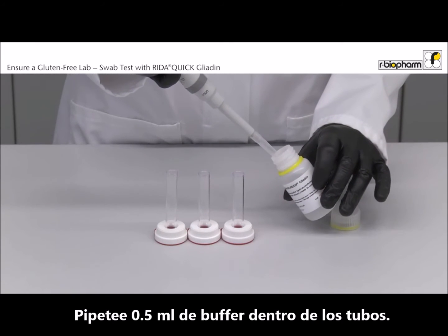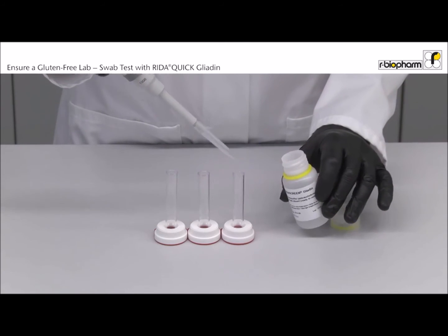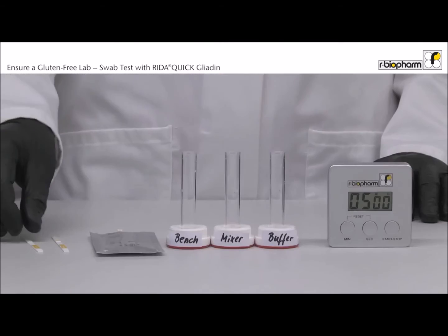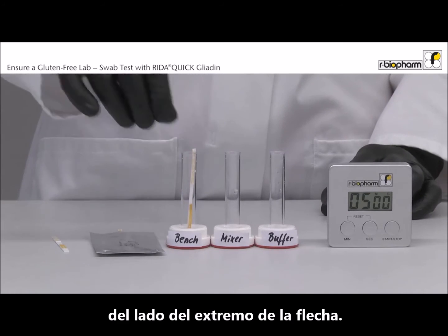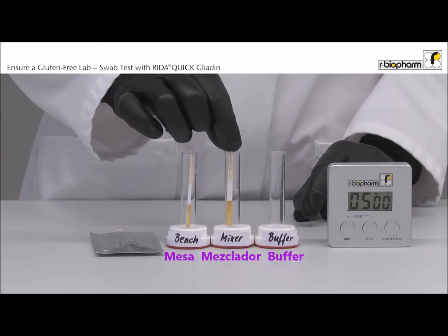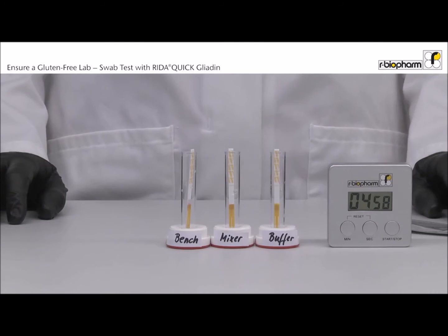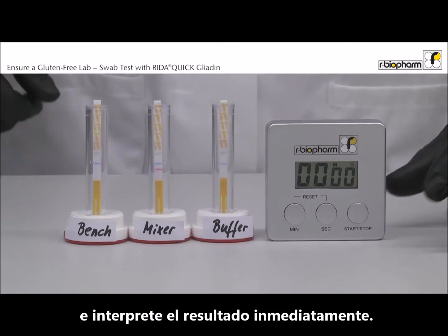Pipette 0.5 ml of buffer to the vials. Place the dipstick vertically with the arrow end into the tube. Incubate the dipstick for 5 minutes. Take out the strip exactly after 5 minutes and read the result immediately.